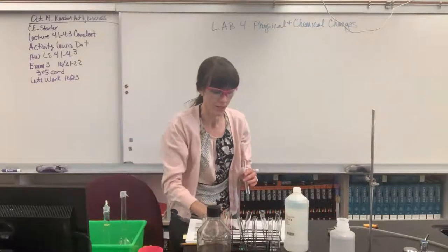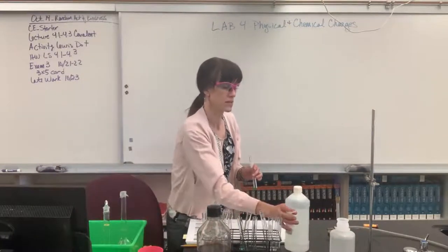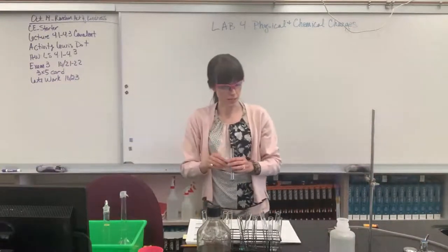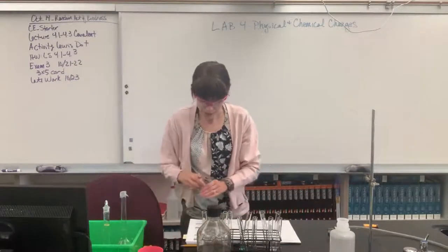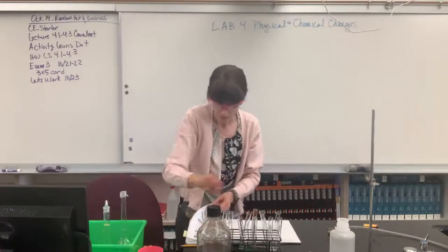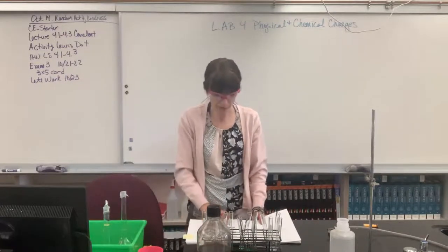Let's record that. Now I'm going to set my hydrochloric acid over here. Want to have some distance between our acid and everything that we're doing. So let's record that. I'm going to go to table 4.3. Oh, so pretty. I had to show you that one more time. Okay, I'm on page 53 and we're on table 4.3.